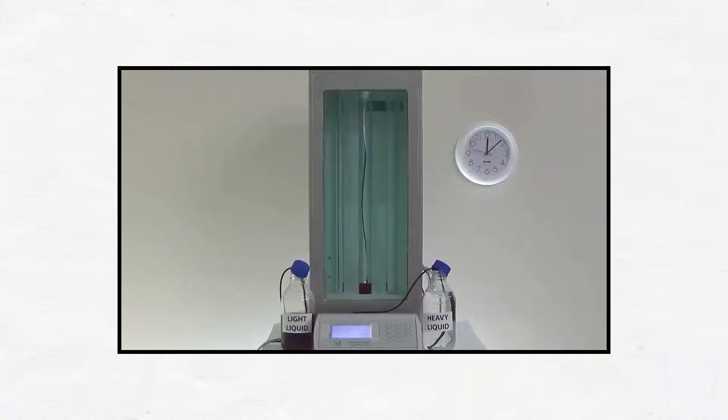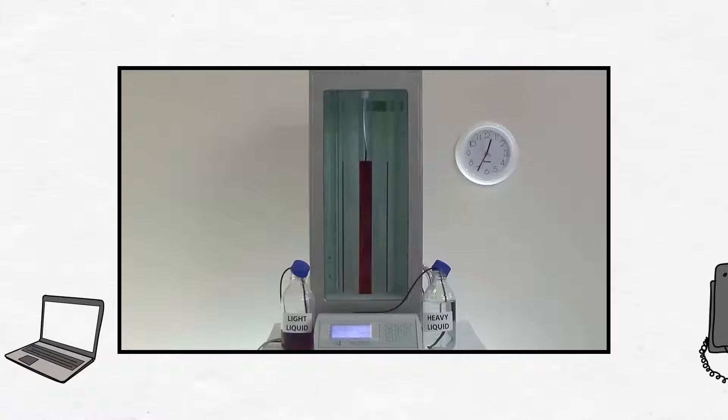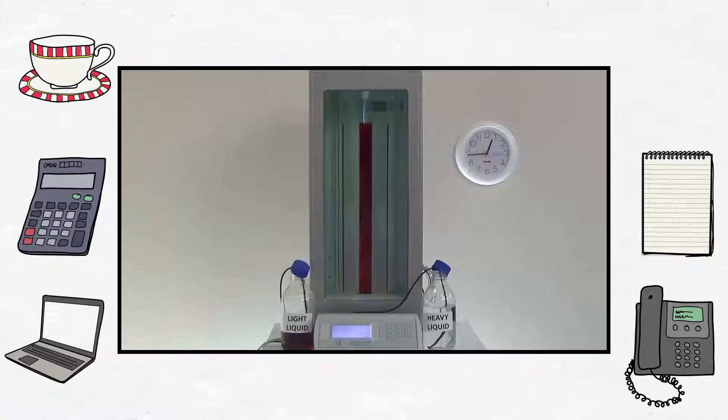All you have to do is prepare the liquids, set the column parameters and go. Because it's automatic, it gives the lab technician time to concentrate on other tasks.